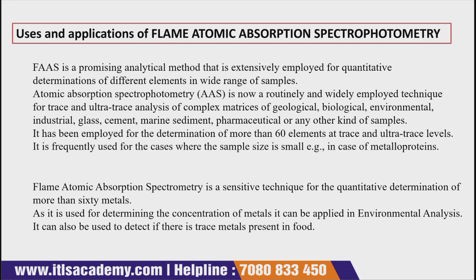First of all, it is used in the analysis of trace metals in different samples. Second, it is useful in pharmaceutical industries, in the analysis of pharmaceutical products. It is used in water analysis. It has applications in clinical research, mining, and food and beverage analysis. So as you can see, it has a great application in every field.